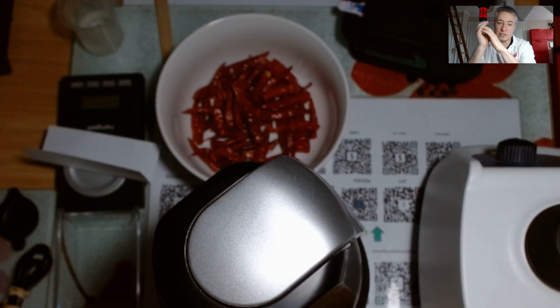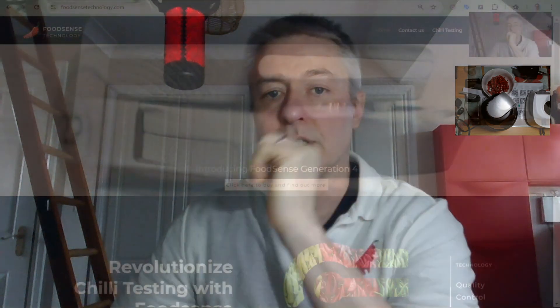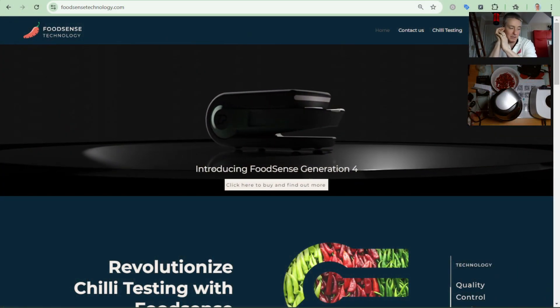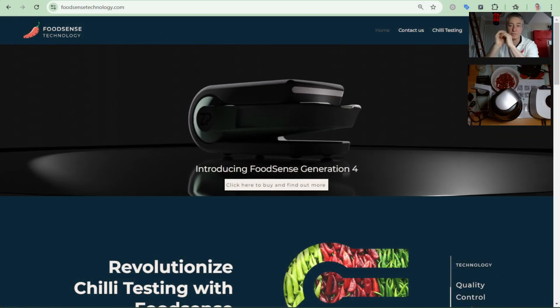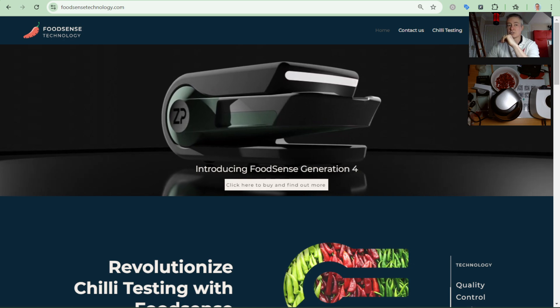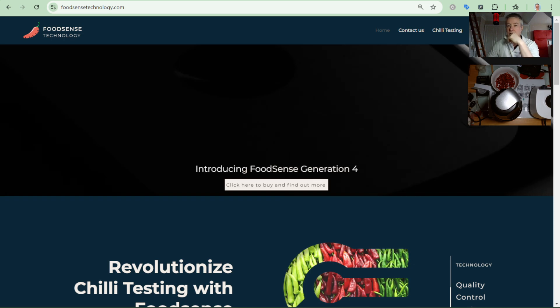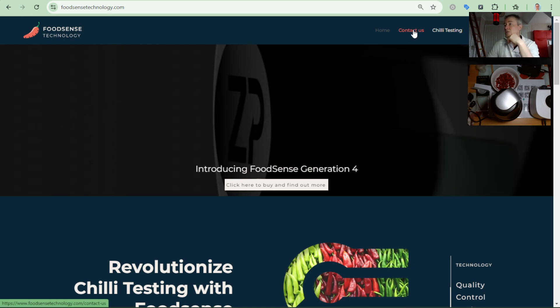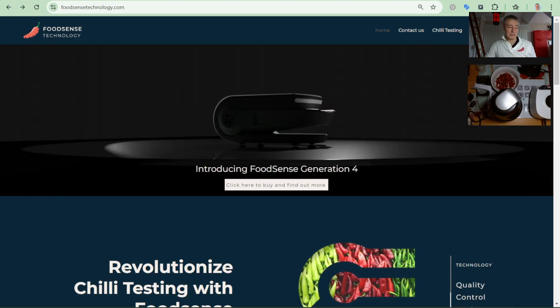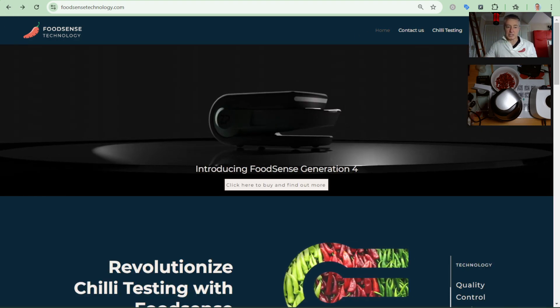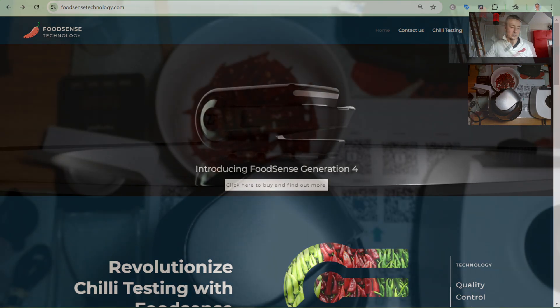What I'll be doing in this video is measuring the hotness of the chillies by measuring the capsaicin in them, and we'll be giving the results in Scoville heat units. The device I'll be using this morning is the FoodSense Generation 4. You can find it at FoodSense Technology. If you've got any questions, you can reach out to us here. With that said, I'm going to prepare the sample in real time now, so rather than talk I'll just get on with it.